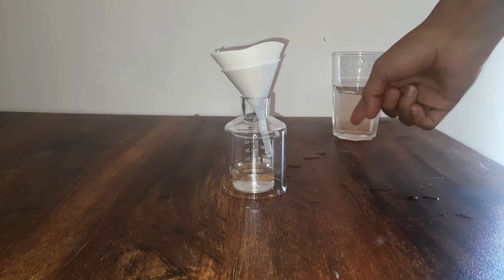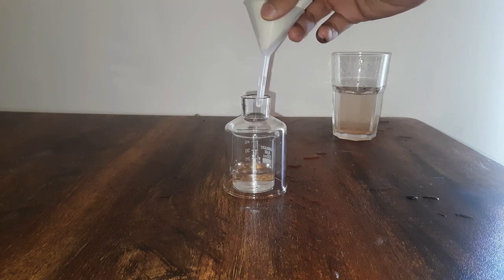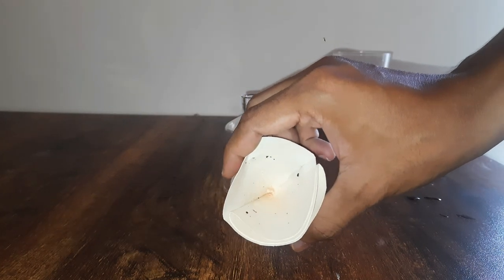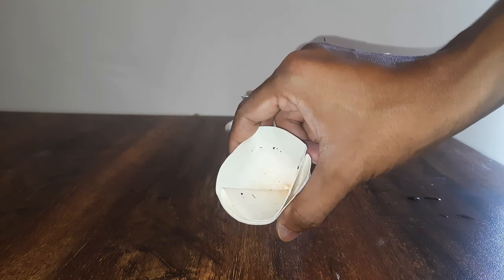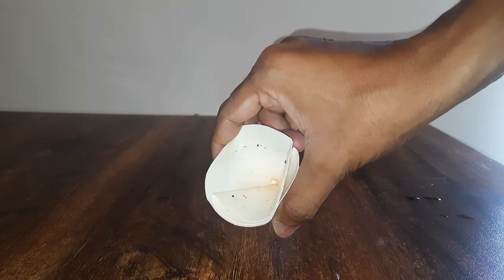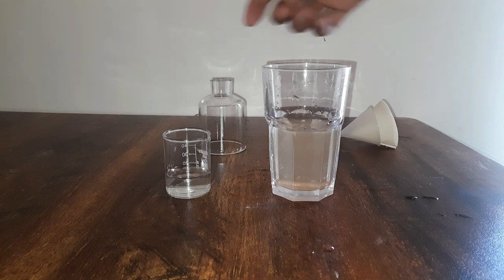Let's try to compare that with the glass over here, so we will remove this funnel. Have a look at all these sand particles that are filtered out. Filter paper works great. Can you at least see the color difference? This one seems less muddy, and this one seems more muddy.